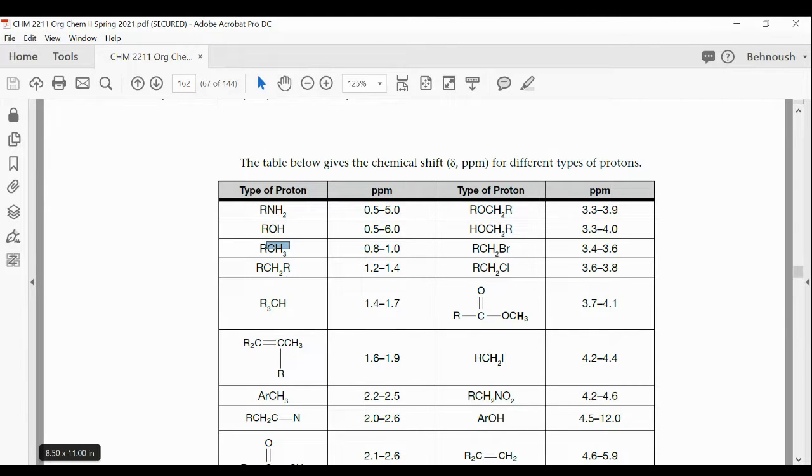So you could see that I at least rationalized that there's a difference because of the perfect. Perfect. Yes. But I don't know if those are the good numbers. It's good as long as, for CH3 that is attached to a carbonyl group, which is an electron withdrawing group, you don't give that 1. The 1 would have been if it's attached to an alkyl group or another simple carbon, no carbonyl group. Any electron withdrawing group is going to increase it, and I don't expect you to give me the exact location. It's just an approximate location, as you said. You have to use the rationale and try to predict the approximate location.